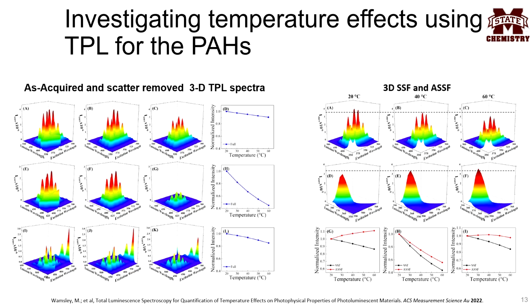It is believed that raising temperature has 2 effects on anti-Stokes shifted fluorescence. On one hand, it enhances the population of hot molecules according to the Boltzmann distribution law, which is beneficial for increasing the anti-Stokes shifted fluorescent intensity. On the other hand, an increase in the temperature can change the relative rates between the radiative and non-radiative decays of the excited molecules, which can lead to enhanced or reduced anti-Stokes shifted fluorescence intensities.